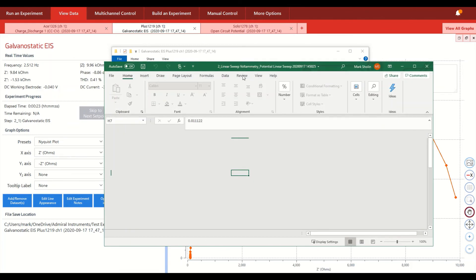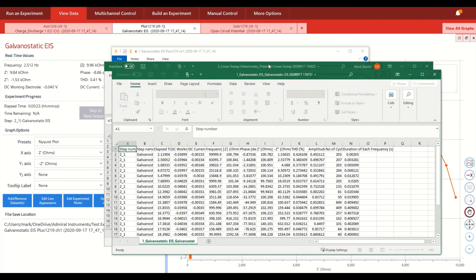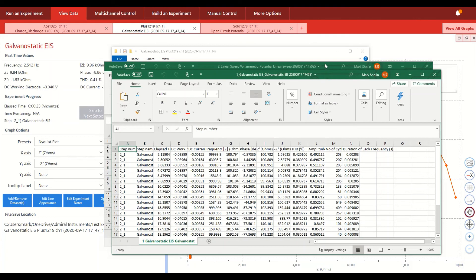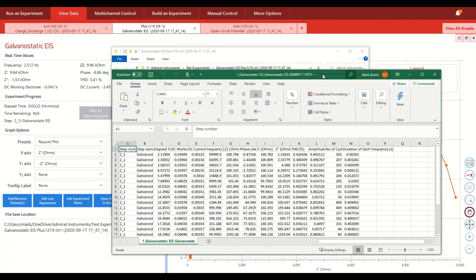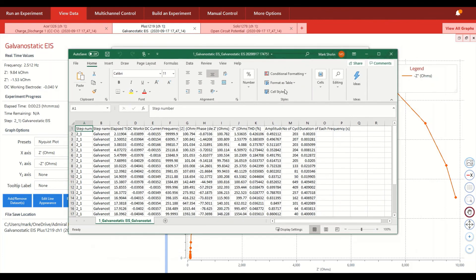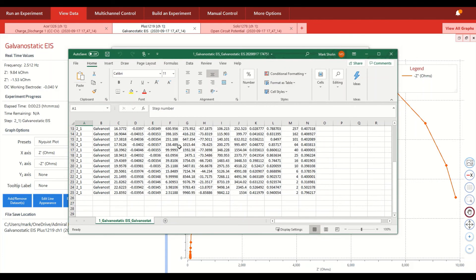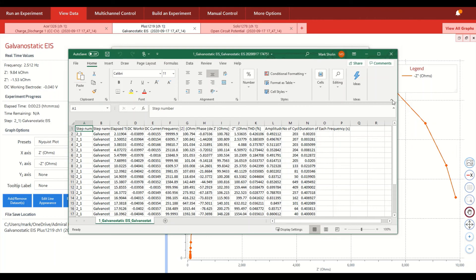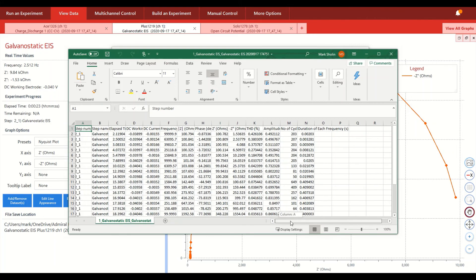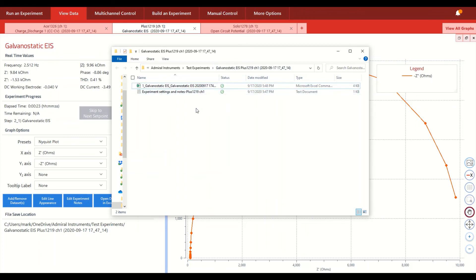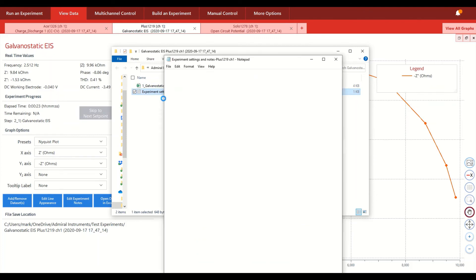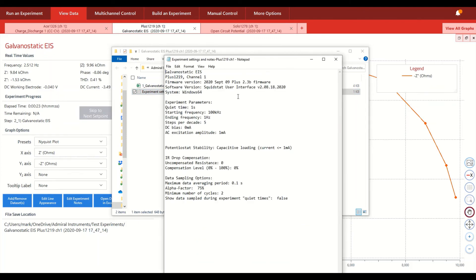So I'm opening this Excel sheet right now for this galvanostatic EIS that was run. Another key feature in terms of the way we save our raw data in the file save location before starting experiments is to have a recording of all the experiment settings and notes that were used to run this given experiment. So all the parameters that were typed in before you started the channel are recorded here for easy access.